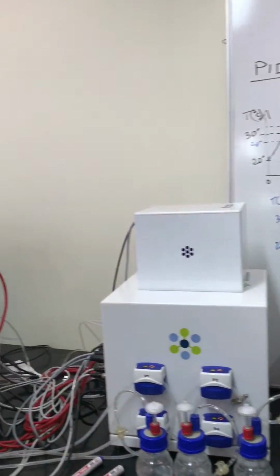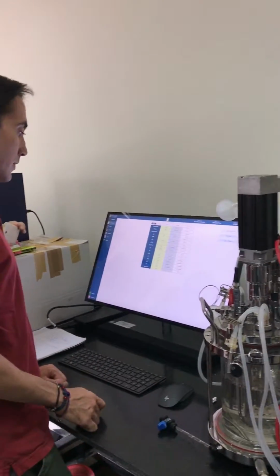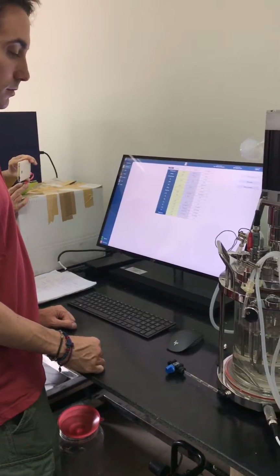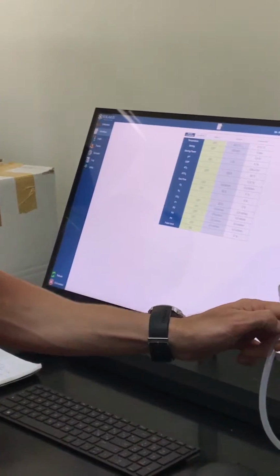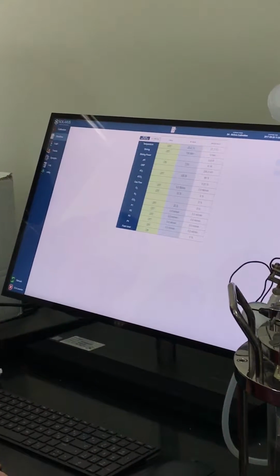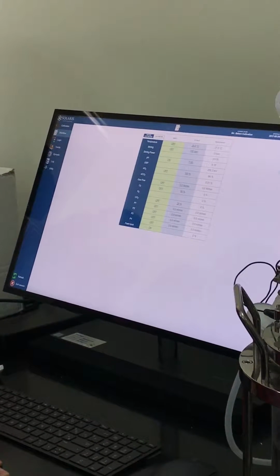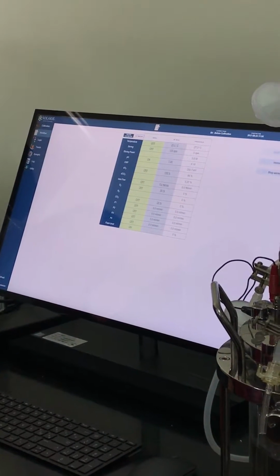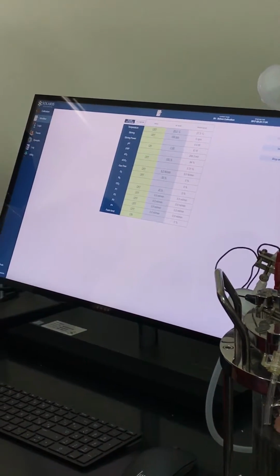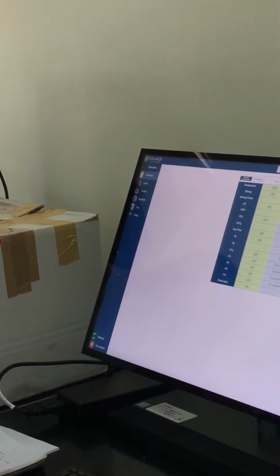Chị hỏi một câu bởi vì nó liên quan đến vấn đề setup từ đầu. Ví dụ cho lên men khí nhé, khi mình đặt lưu lượng khí, ở đây bạn ấy đã đặt ở tốc độ theo cái tối ưu của bạn ấy ở bên kia rồi. Thế nhưng bây giờ lý do là vi sinh của bọn chị cần khí ngay từ đầu rất là nhiều. Vậy thì việc setup lại đấy có cần phải lưu ý gì không?